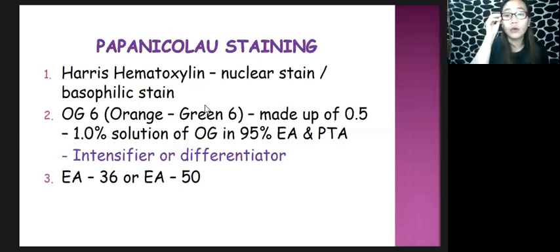Remember, I discussed also what are the different solvents that we can use in the preparation of your stains. We can make use of water, phenol, alcohol, and I forgot the other one. You should understand why we have to perform dehydration.